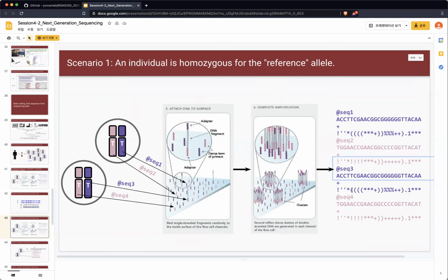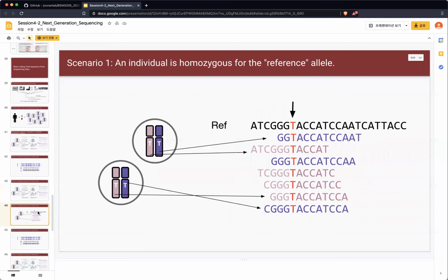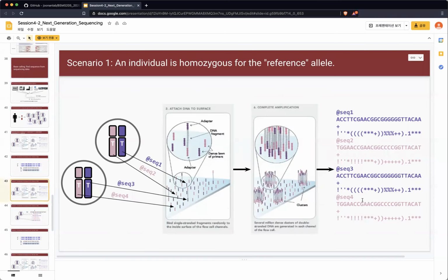So we have the 2-to-2 ratio, but we might not have the 2-to-2 ratio. It depends on how many libraries are sequenced in the machine. So it's random, but only for the representation, I put the 2 and 2, right? Okay, so then you have multiple of this sequence information from the machine. So not just 4, it's probably billions of that.